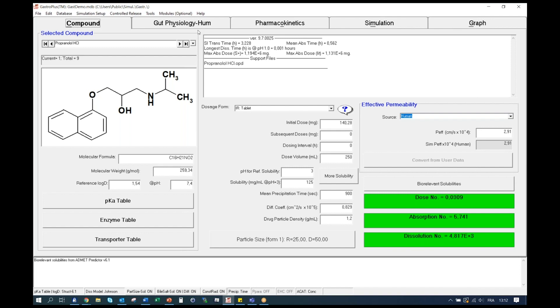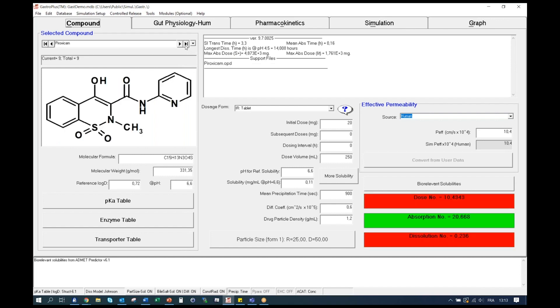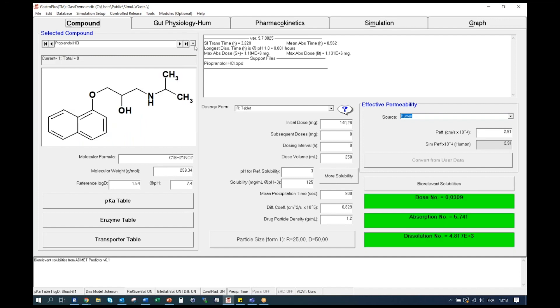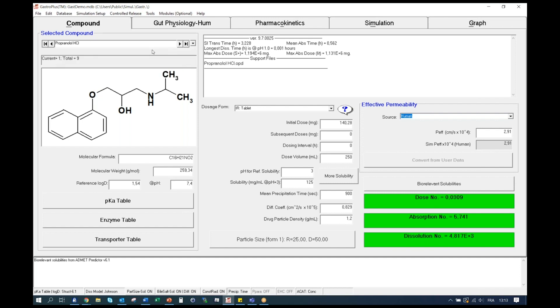When you open the software, by default, a demo database is loaded. This database contains nine records, and you have different ways to navigate through these records. You can either go to the next record by clicking on this arrow — here you can see that we went from metoprolol to propranolol. You can go to the very last record by clicking on the second arrow; now we are on piroxicam. You can do the same going back. You can also look at all your records listed and select any one you may be interested in. Let's stick to propranolol during this demonstration.